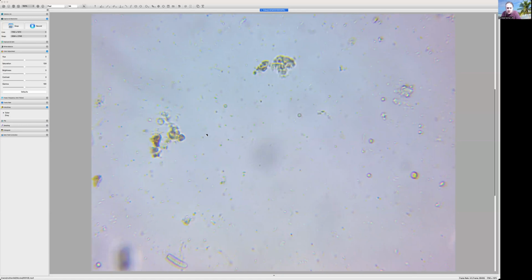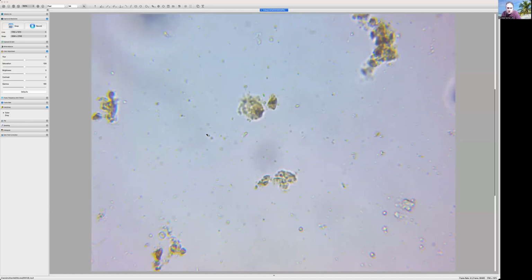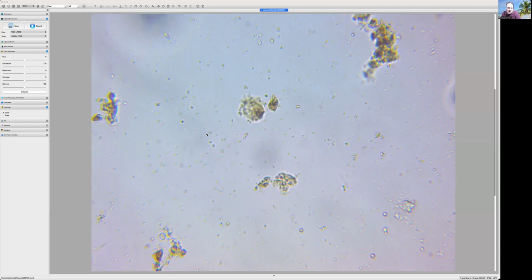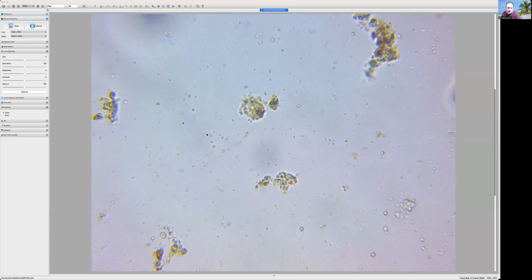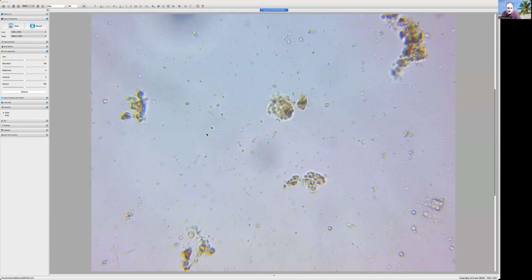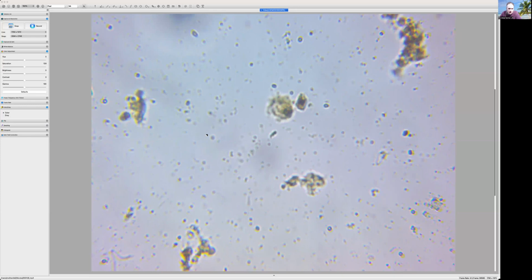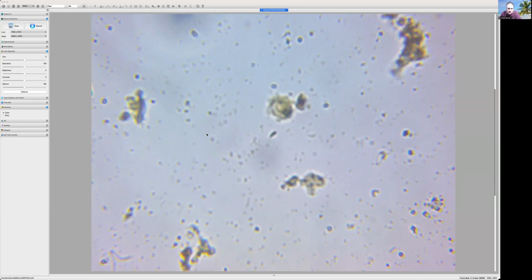Those shadows are potentially, the way they move so fast, I want to see a spirillum, but just can't find one to get a good zoom in on them. I just feel like we've got really good bacterial numbers here and flagellates.